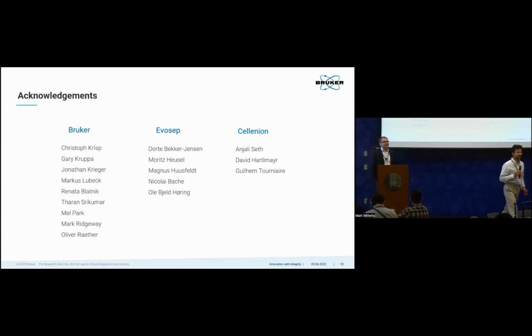Great. Sounds like an exciting space to watch. I see a couple of questions. I have a question about TOF and Orbitrap, so not just the ion mobility. Is there any advantage to using a TOF compared to an Orbitrap, specifically for single cell? If you're doing TIMS, the TIMS is a very fast process, right? Every time we ramp down the electric field is a step, and those ions are sent to the mass analyzer.